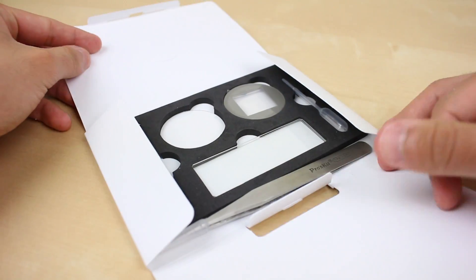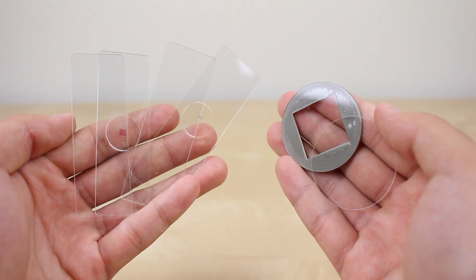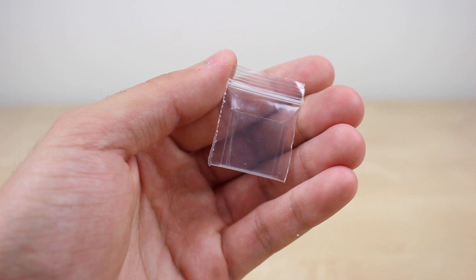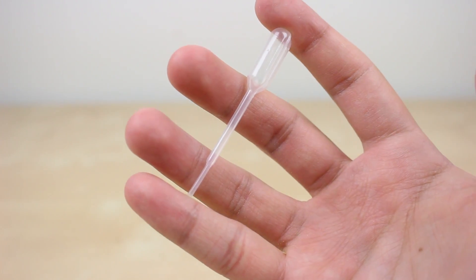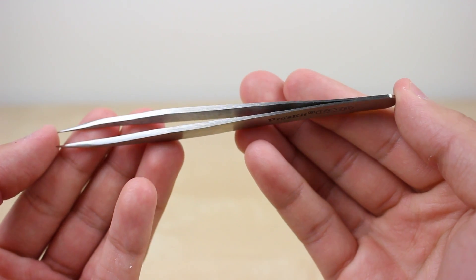Also included is a full kit that has everything you'll need to use it. There are rectangular and circular slides, some of which are already prepared and ready for viewing. It also comes with five cover slips, a dropper, and even tweezers, so you're fully equipped and ready to go when you buy this microscope.